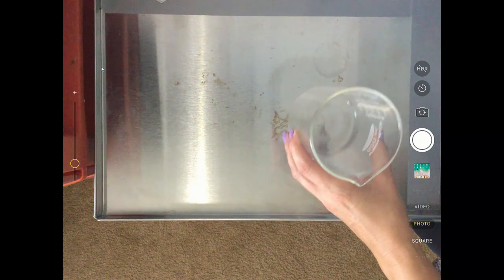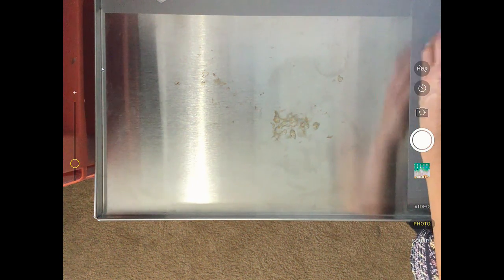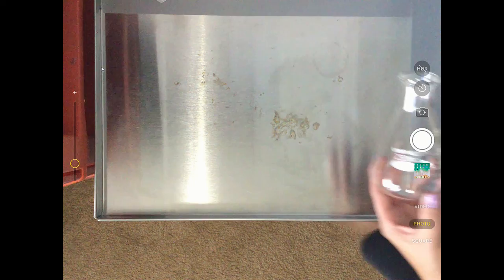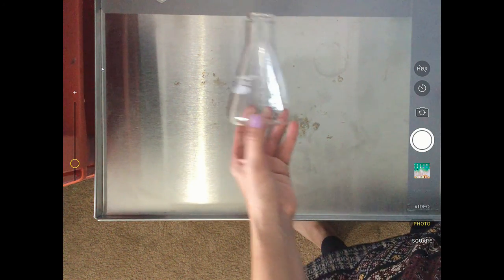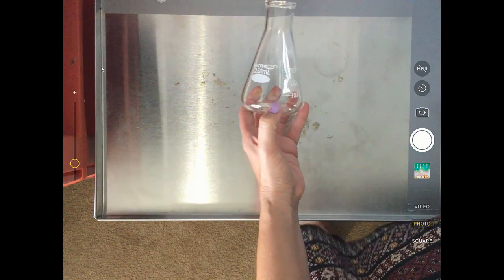So one of the lab tools that you'll see us use a lot in class are beakers. They do come in all different sizes. Do not confuse a beaker with an Erlenmeyer flask. They are not the same thing. This is a beaker, this is an Erlenmeyer flask.